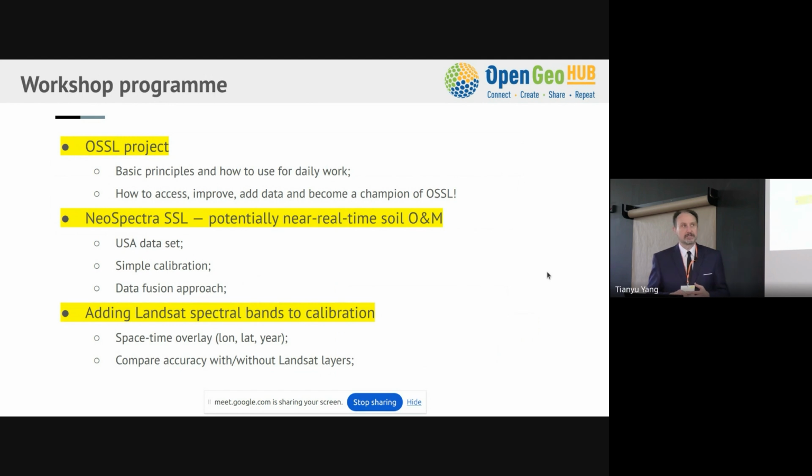And I was very interested in this data set because it is a bit less expensive instrument, with fewer spectral bands, a bit narrower part of the spectra, only up to 2,500 nanometers. And so we are trying to improve the accuracy.